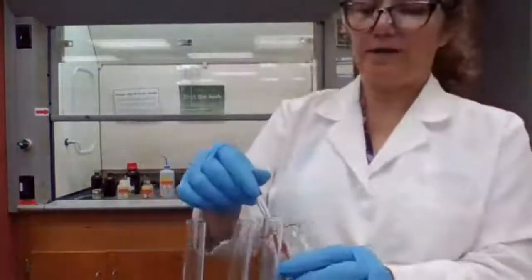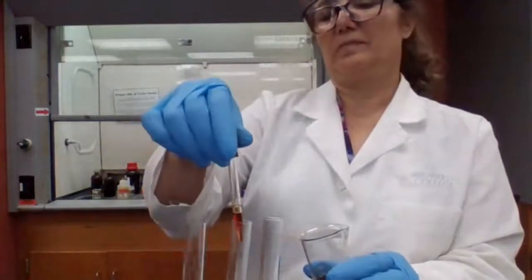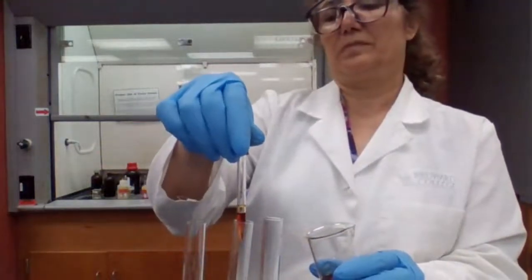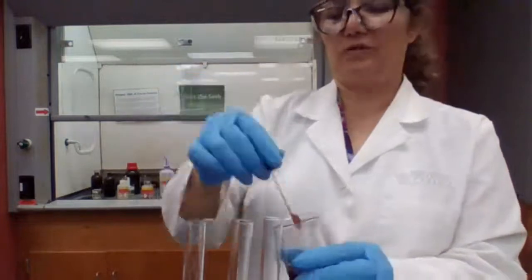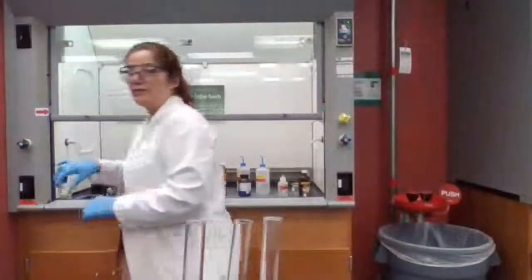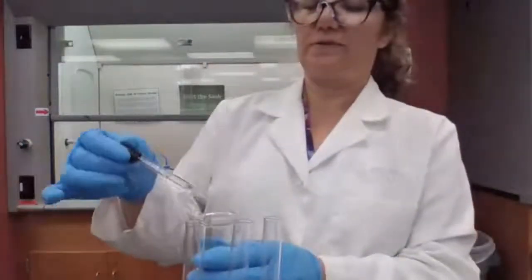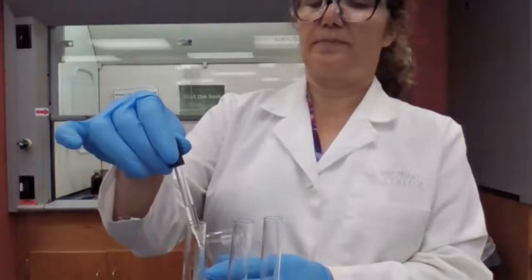This is a secondary, 4 drops. Was it 4 or 5? 4 drops. And then for dimethylaniline, also 4 drops.